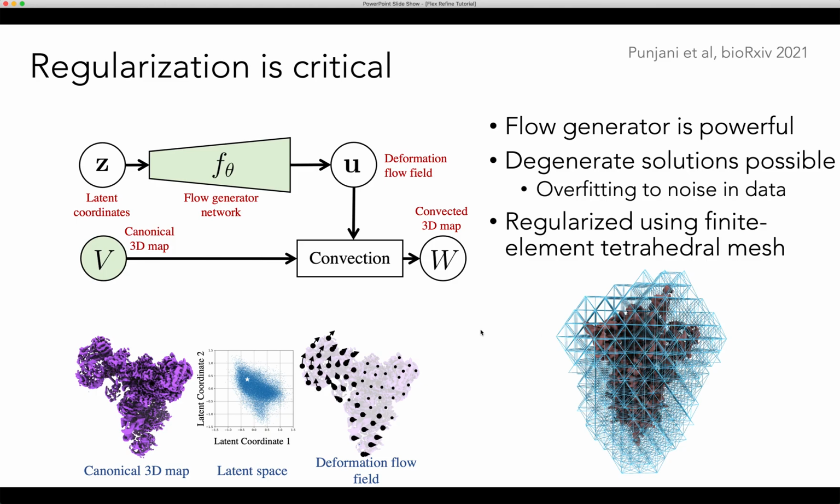When that happens, the 3D Flex model, because of the topology of the mesh that we provided, is not capable of separating those two domains in a clean manner, since it's only allowed to deform each tetracell by moving around its vertices. It can't, for example, cut a tetracell in half or make new tetracells within the mesh. Those are fixed from the beginning of training the model.